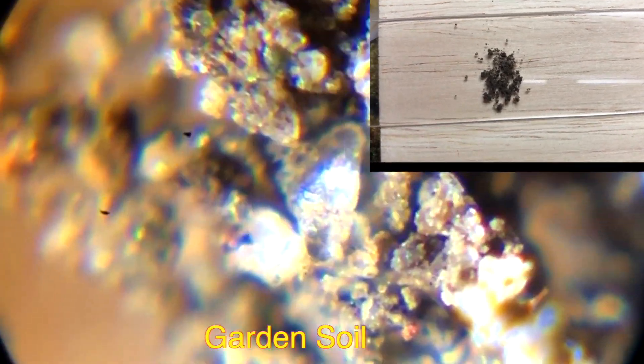Looking at garden soil under the microscope, you can see pretty much anything — sand, sand crystals, and a lot of things.